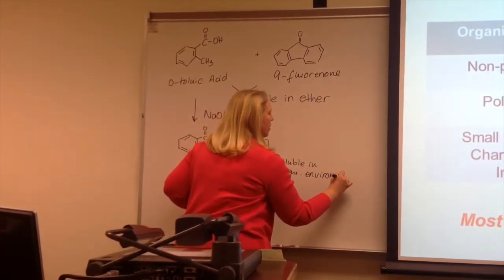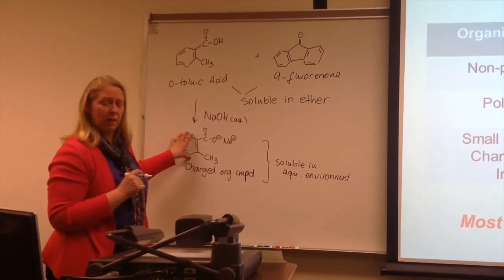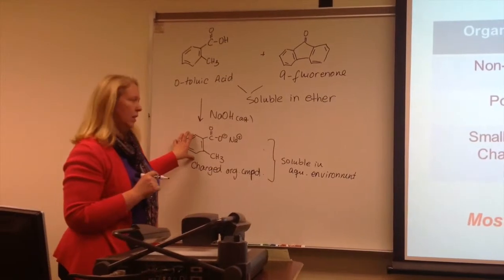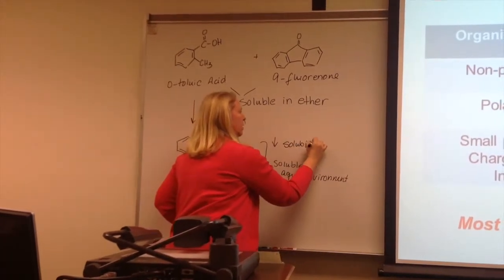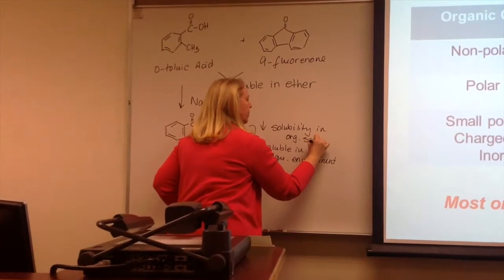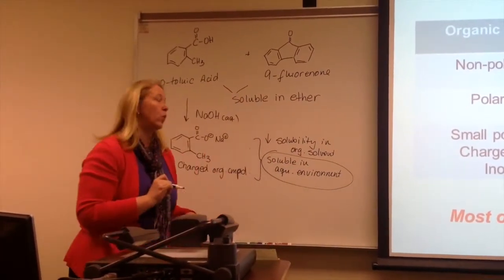So we decrease the solubility of this compound in the organic solvent, but we increase the solubility in the aqueous environment. Okay, and this is the key part of why this experiment works.